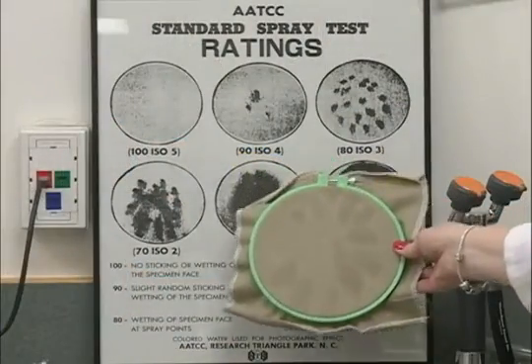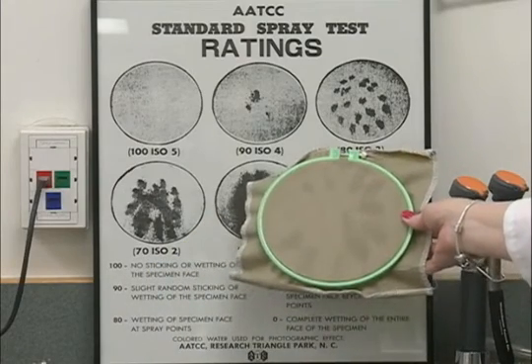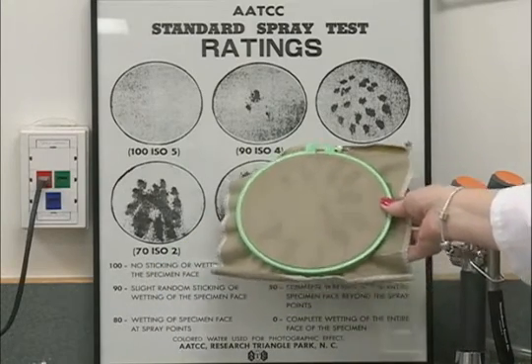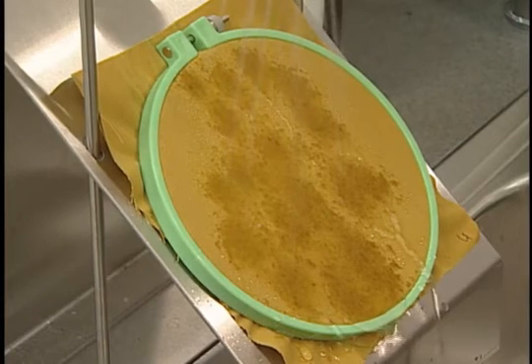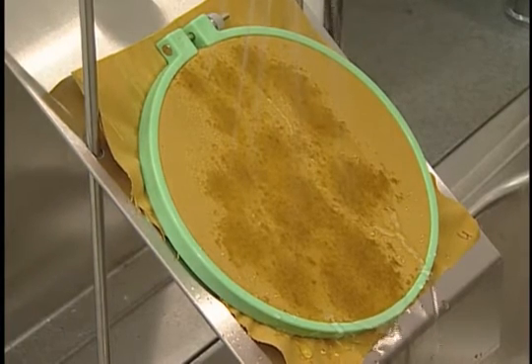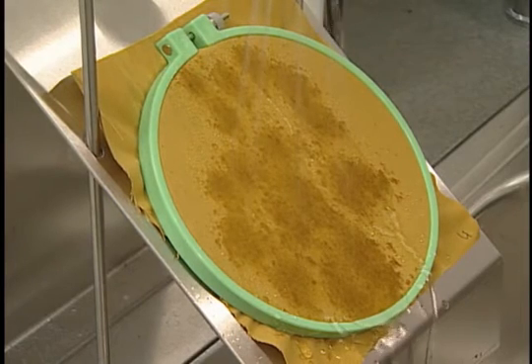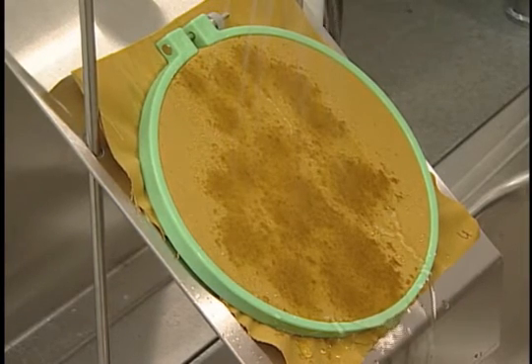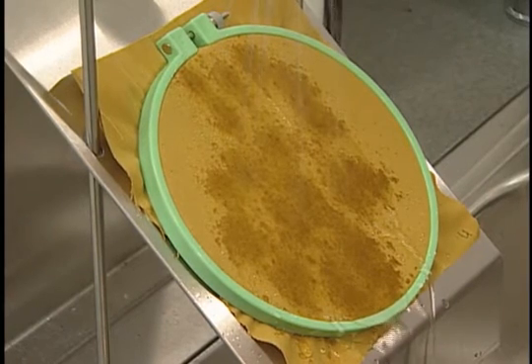The specimen is then compared to the AATCC spray rating scale and given the numerical grade that matches one of the pictures most closely. The AATCC spray rating scale shows numerical grades from 100 to 0, where 100 equals no sticking or wetting of the specimen, 90 equals slight random sticking or wetting, down to 0 which equals complete surface area wetting.